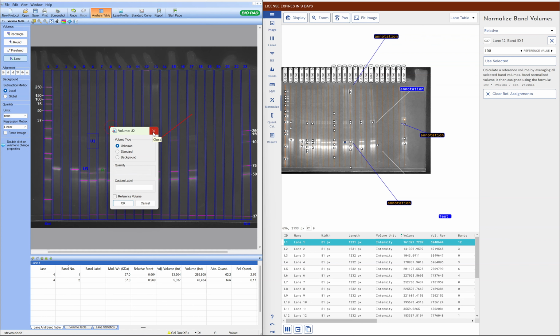So I think the value of this is being able to just define an area, and you want to compare volumes within the image that are not strictly bands. So they could be rectangles, they could be round sections. I think this is probably more to do with the fact that Bio-Rad sell this image analysis software as being 1D and 2D, whereas we just do Phoretix 1D as 1D.